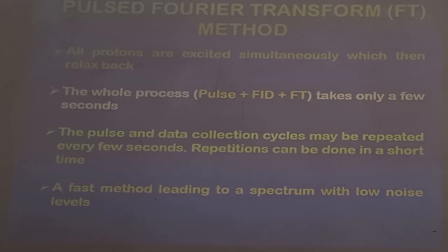So now you have enough time, you can scan it again and again. What that means is that if you can repeat this whole process again and again within a short period of time, you can enhance the signal intensity and you can reduce the noise levels.